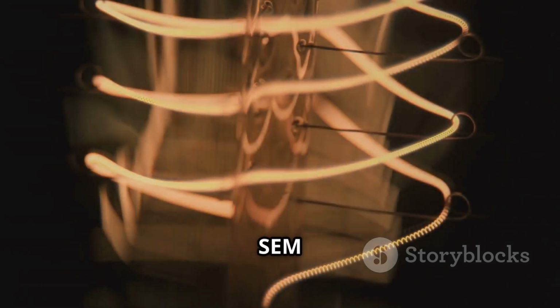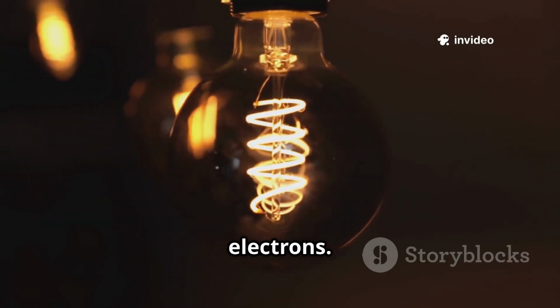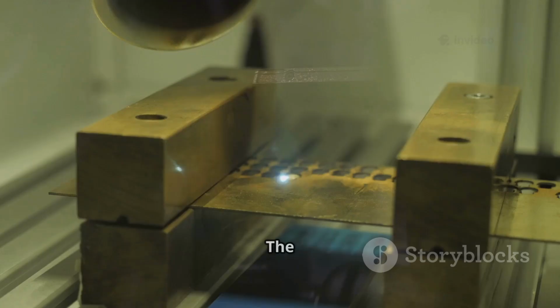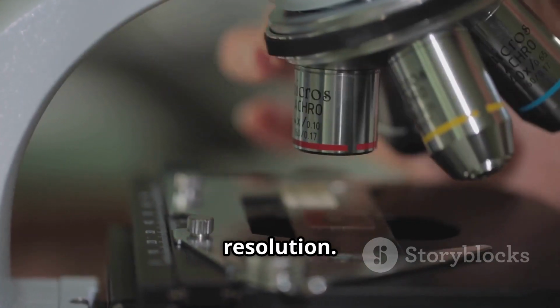At the top of the SEM is an electron gun, a heated tungsten wire that releases electrons. These electrons are accelerated and focused into a fine beam using powerful magnetic lenses, not glass. The beam is narrowed to less than a nanometer, allowing for ultra-high resolution.